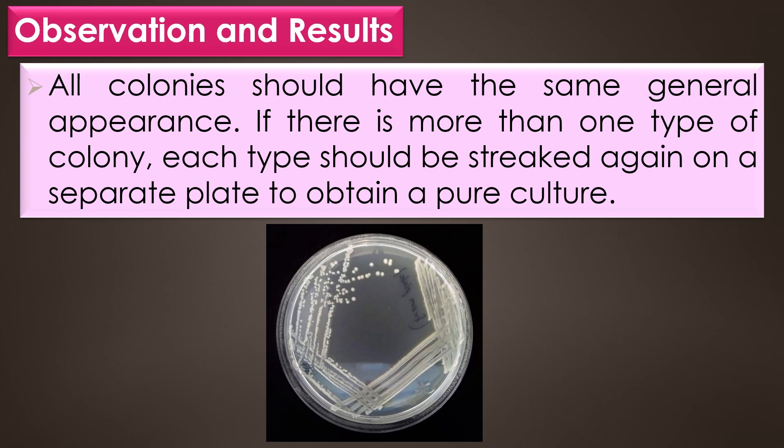After incubation, examine the bacterial colonies — that is, the colony growth on the plate carefully. All colonies should have the same general appearance. If there is more than one type of colony, each type should be streaked again on a separate plate to obtain a pure culture. This is the observation and results.